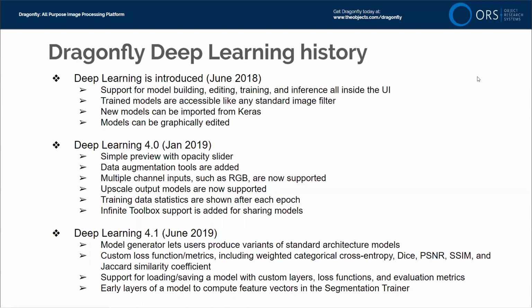But once you have trained a deep learning model, those first couple of layers are the layers that do feature detection, and those features can be assembled into patterns that help you differentiate the different materials of your sample. Those feature detectors can be quite valuable, and they're learned as a result of the training. They're not engineered by a software programmer. Those models, those features can be quite useful.